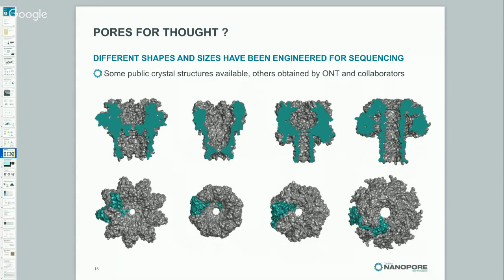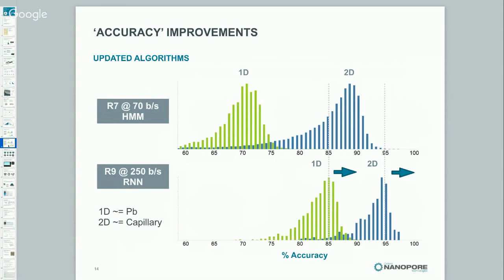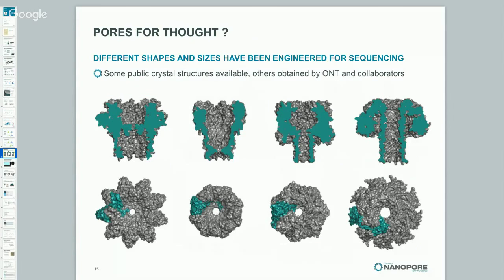Now, what's this R9 thing he's talking about? Well, again, people who are customers will know that we've been talking about it for quite a while. I'm going to talk about what it is in a second, but here are some well-known and published nanopores in section at the top and top-down view at the bottom, just to show people what we're dealing with, protein nanopores. And you can see, again, I think the crystal structures for these are all available, and there are fairly extensive publications for all of them.